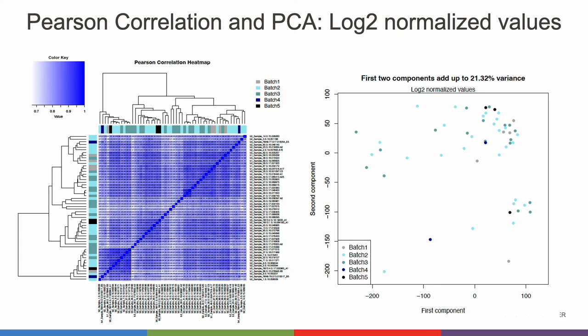And this is a little biological data. Basically, they sent the samples as batches 1 to 5 because they don't do sequencing on the same day or in the same batch. When they did clustering using the samples, many of them are breast cancer, many are liver site or lung site. You can see the correlation between different tissues is by tumor site, not by batch. So the batch didn't affect the gene expression, and most of this is biological. If you are from breast tissue, the correlation is higher than with other tissue. Anyway, as expected, this shows the quality of the RNA exome seq.